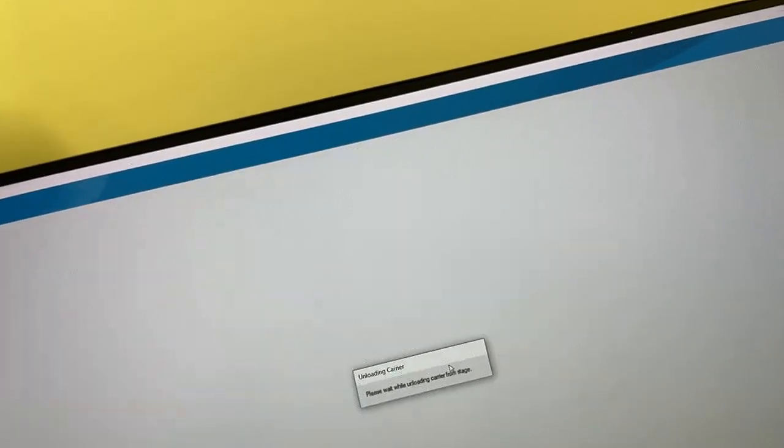No, I've never used good microscope software. It's all been bad. The stuff in the other room I was showing you, I had to debug myself at some point because we got an update and it would just crash immediately. It turned out the camera was not uninitializing when the software closed. I had to manually change something in an INI file, and then I wrote the company and they said you have to do this on this line and change these. They should have called me and said that.